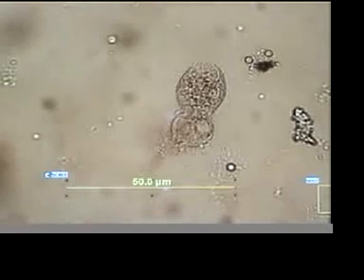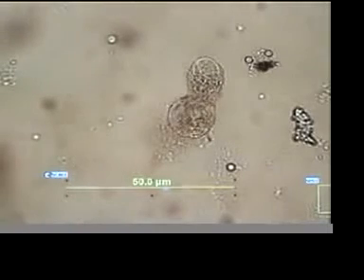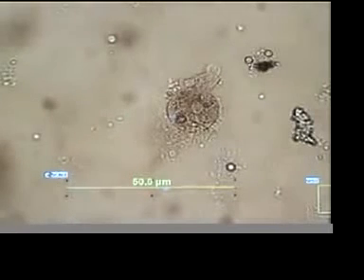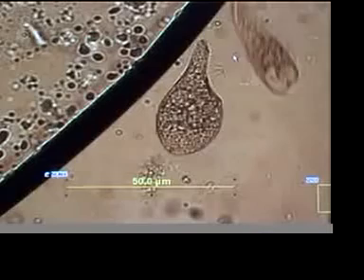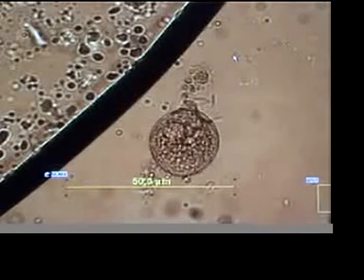This is live, using the F125 program, which I have written and named Blepharisma 11F, using 2 frequencies that devitalize the organism. This took 2 passes. Let's go to 923. Oh wait, here he goes. He's changing in real time.